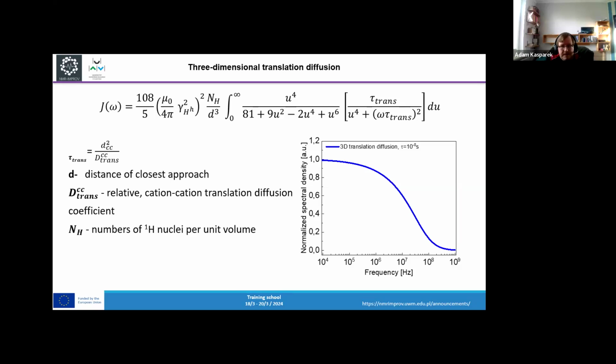Of course, the geometric factor will change depending on what resonance frequency we check, whether it is one hydrogen or other atoms. But when we are checking just hydrogen resonance, it will not. This is a physical constant which will not change depending on the system. This is the last part which changes depending on our system.